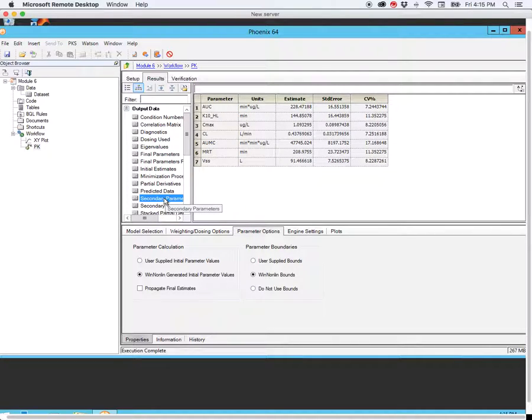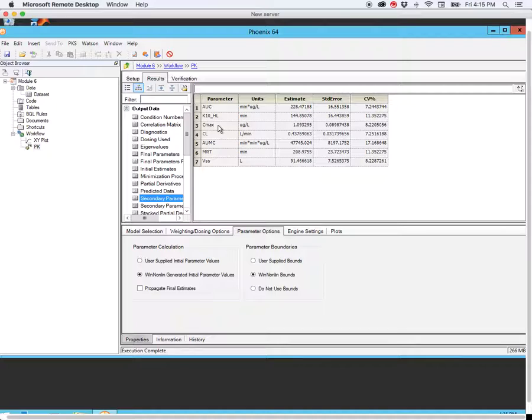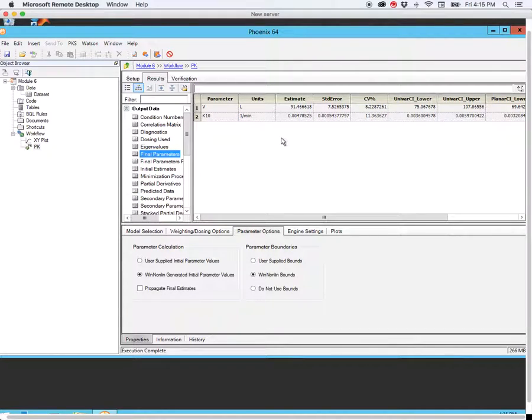We also notice that we have secondary parameters — these are all the other parameters that were not calculated as primary parameters for this model. We have area under the curve, which is the same as the AUC extrapolated to infinity for a non-compartmental analysis. This is the elimination half-life, the maximum drug concentration, and the clearance. Because this is IV bolus, the Cmax will also be the C0, where the curve crosses the y-axis. We also have area under the moment curve, mean residence time, and the volume of distribution at steady state. Notice that because this is a one-compartment model, that value is the same as the volume of distribution.